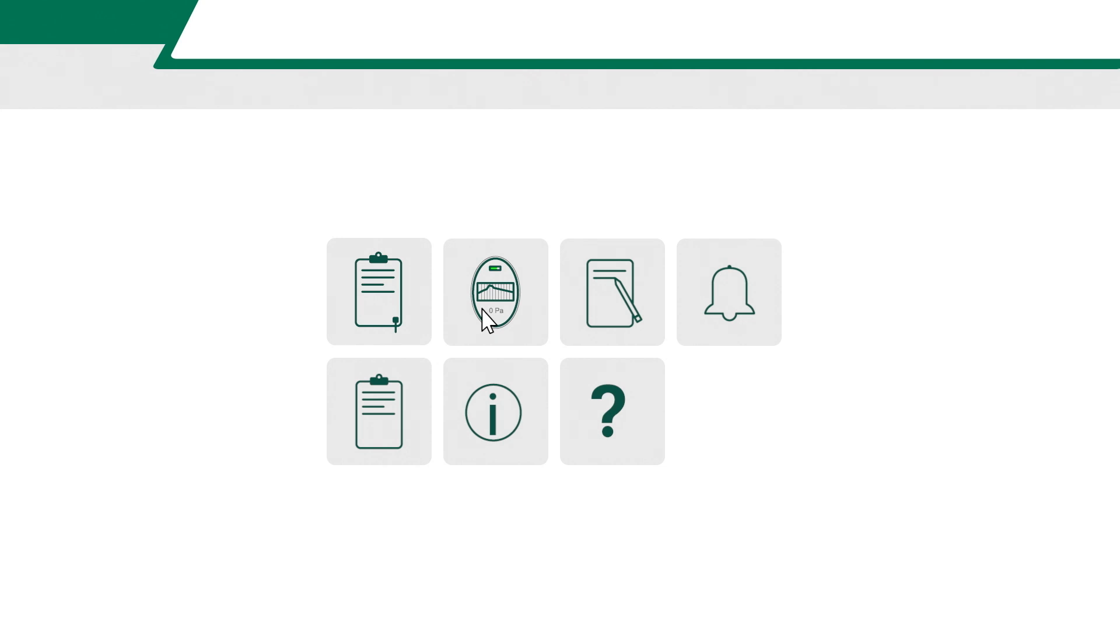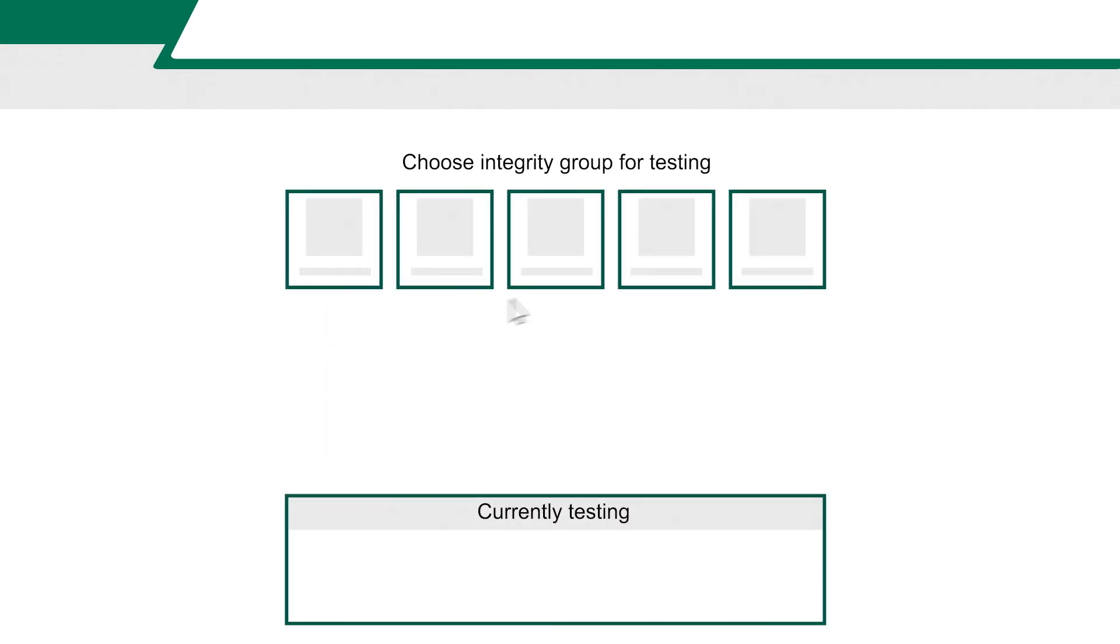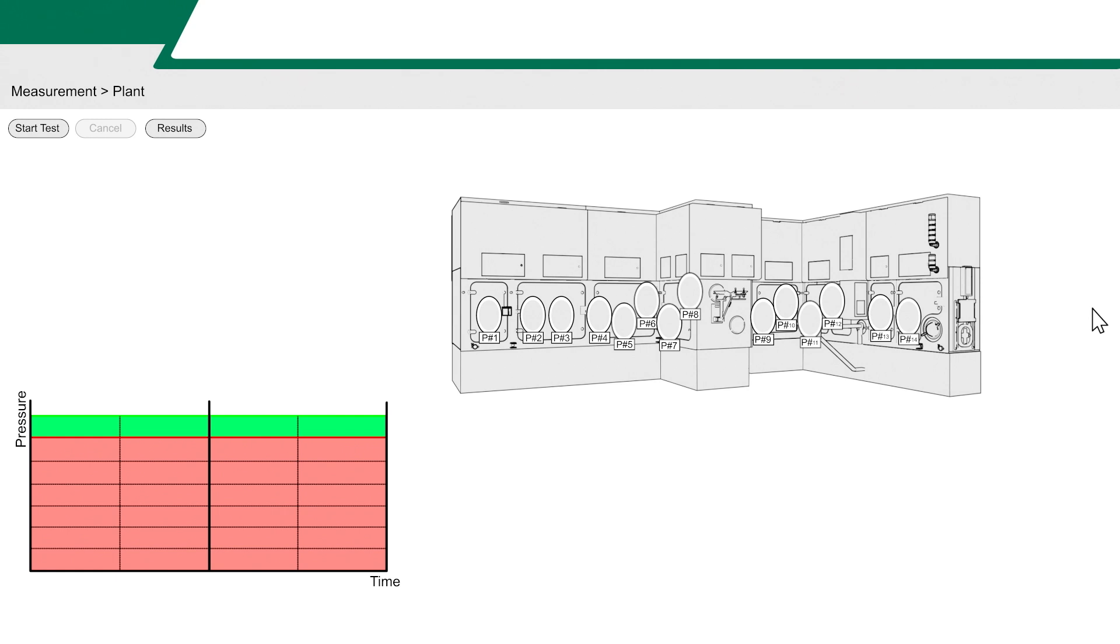In the Franz Zeal software, you'll have an overview of all your integrity groups. Multiple gloves can be tested simultaneously.